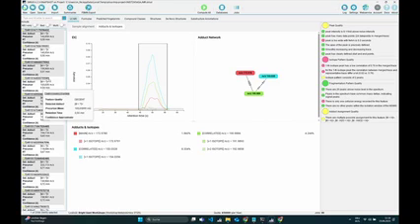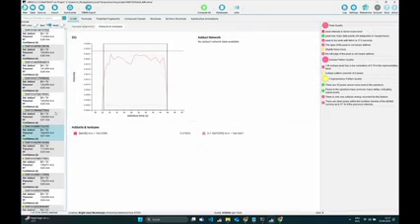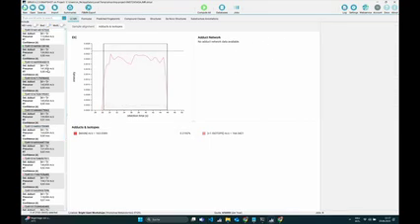Just one thing that I want to show is there's now, perhaps for people who have used SIRIUS before, but not the new version, some toggles in the top. And there are also some features where we would get this red circle for the traffic light system, which we think there is not too much information inside, which we just say are bad features. And if you want to look at them, by default, they are hidden. But you can click on this toggle, and then you will also see, okay, here are some features with these red circles where something seems to be clearly wrong. But we will disable this again and get to the normal view.